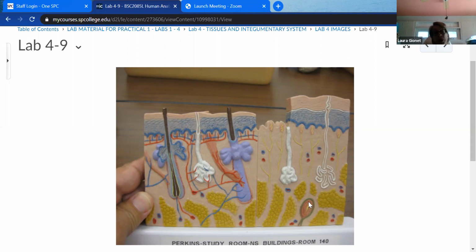Down here at the bottom, you can see the lamellated aspect to it. It kind of looks like an onion that you cut into, and you can see all the layers. That's not bad for a Pacinian corpuscle, but I'm more likely to just use those that are the most obvious. I think it is fair to ask you about layers: this upper layer, starting in blue and going upwards, is the epidermis. The middle, with mostly tan in the background, would be the dermis, and wherever you see the fat and below would be the hypodermis or subcutaneous layer.